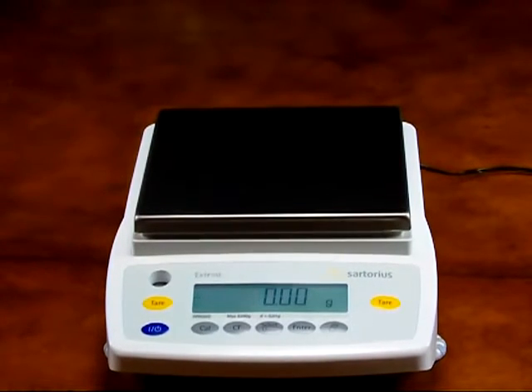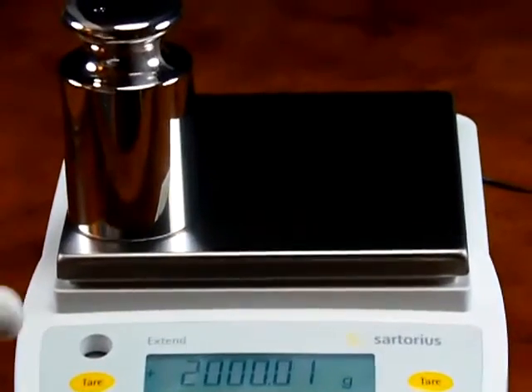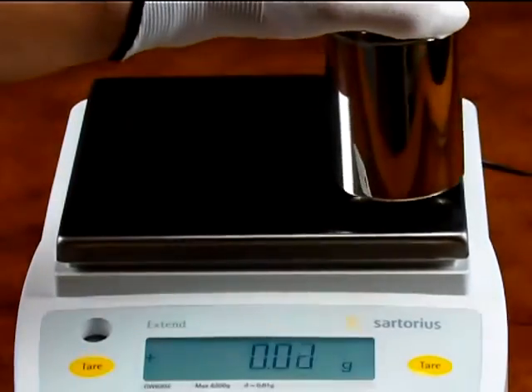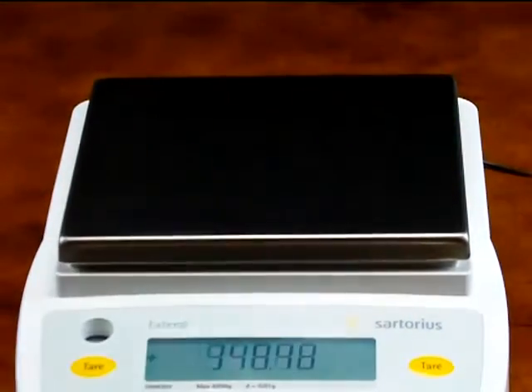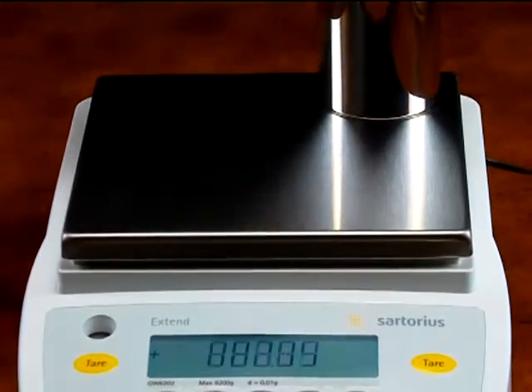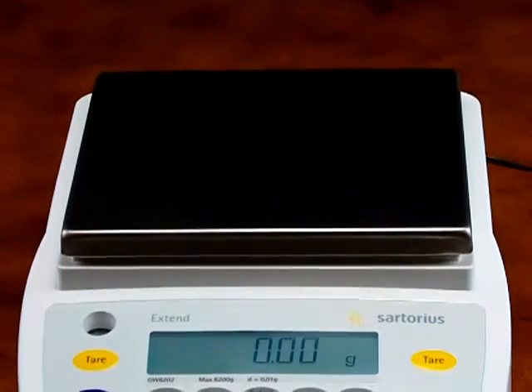The beauty of a Sartorius balance is the performance. Notice the corner load weighing — the balance is within tolerance. Competitive models on the market cannot perform like the Sartorius. Sartorius holds the Guinness Book of World Records for the most accurate balance in the world.